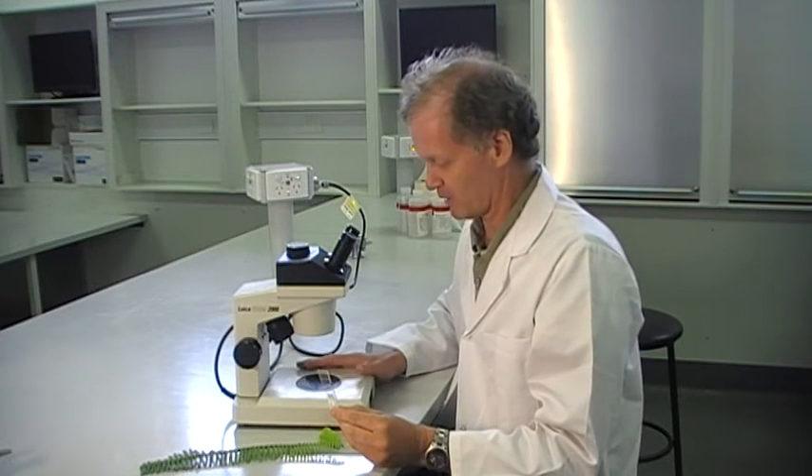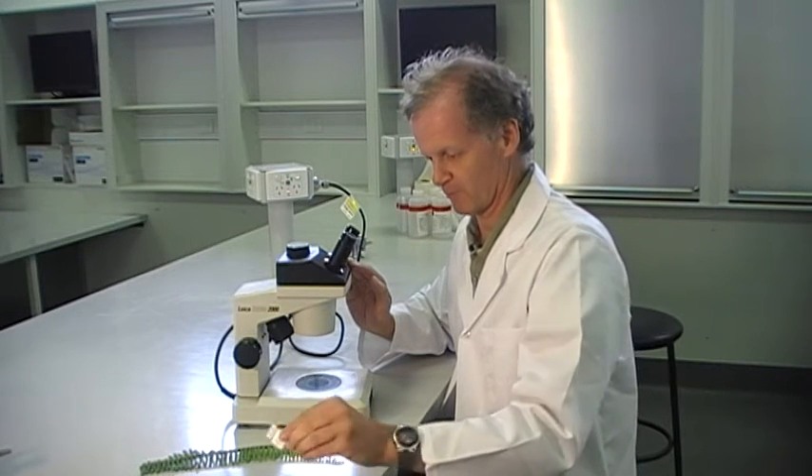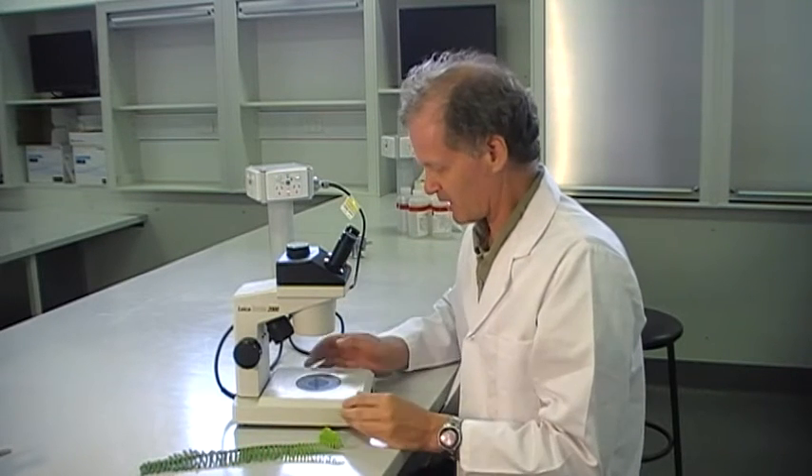The compound microscope, looking at slides like this, as John said, goes from times 40 through to times 400 or even times 1,000. With this microscope it starts off at about times 7 and goes through to times 30 or 40. So at its highest magnification, it's overlapping with the lowest magnification of the compound microscope. Pretty much the same basic controls but a whole lot simpler.